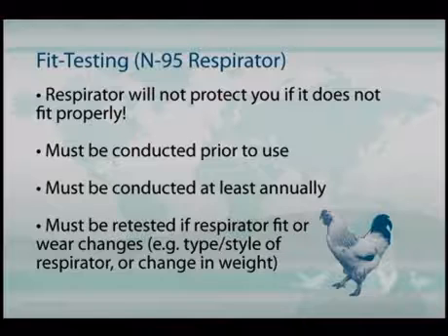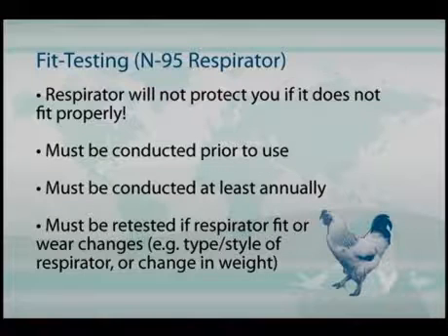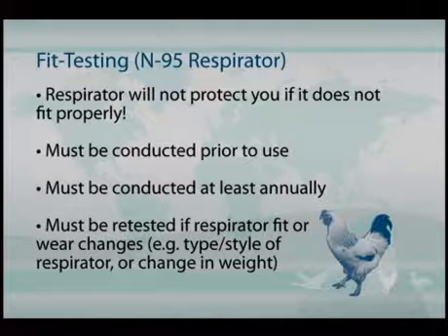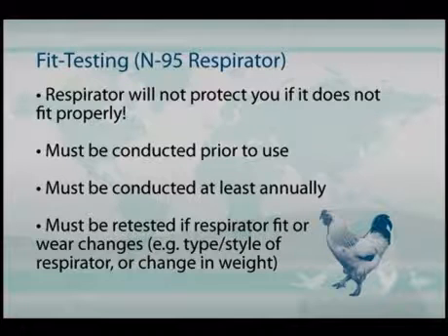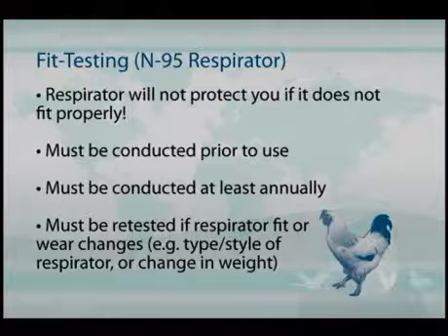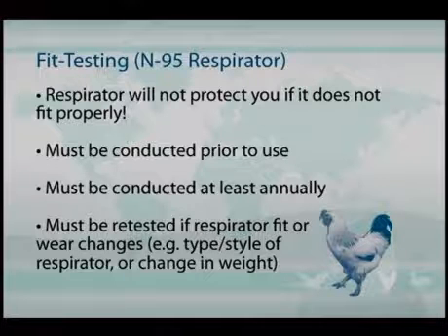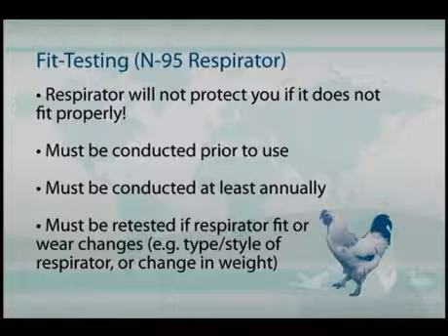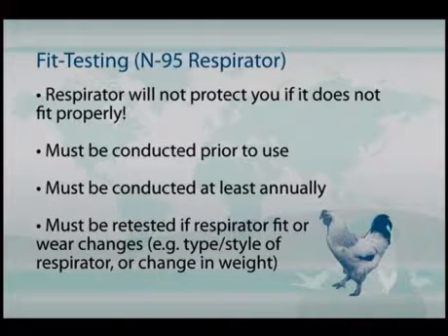The fit testing has to be conducted, as I said, prior to its use. They must be conducted annually. So just because you get fit tested now doesn't mean that you are good forever. And particularly if you've had any changes in weight or the type of respirator, you need to have a refit for that particular style, or in the case if you have extensive weight loss or weight gain, the size and shape of your face may not fit that same respirator in the future.